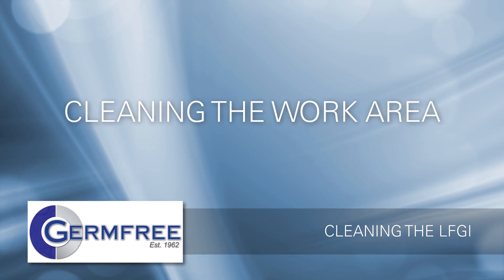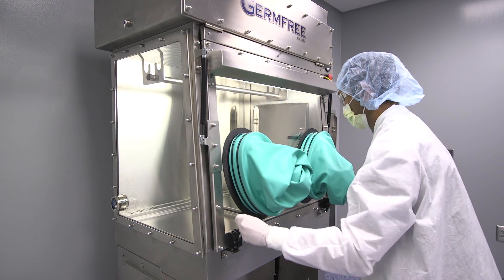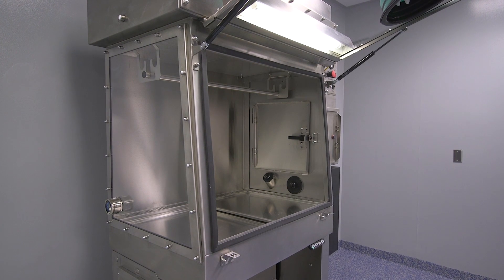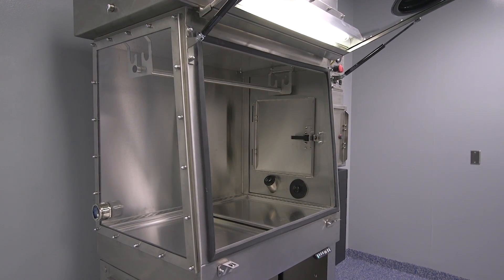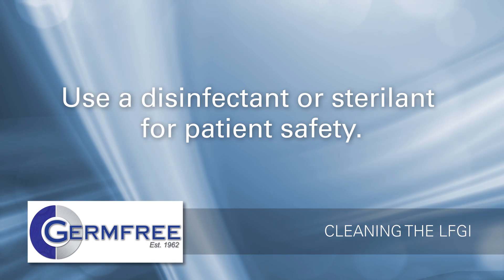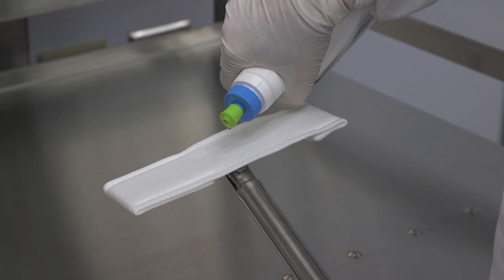Once you've finished cleaning the airlock, you're ready to begin cleaning the inside of the LFGI, also known as the work area. If the environment in which your LFGI is operated is cleaned, you may elect to open the front access window to make it easier to reach around the inside of your LFGI. To maximize patient safety, a disinfectant should be used on all of the work area surfaces.